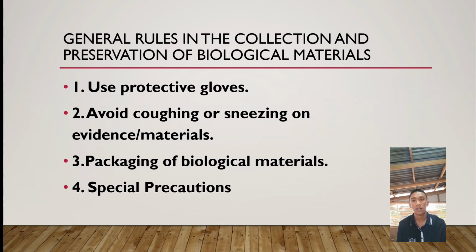Fold the opening of the bag twice and seal with tape. Envelopes should also be sealed with tape. Fourth is special precautions. Make an explicit note if a person from whom material has been collected is suspected of having an infectious disease.